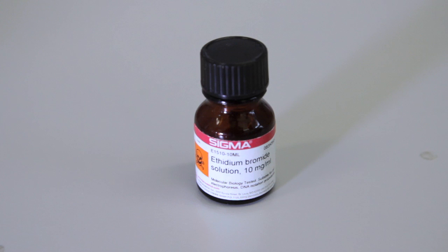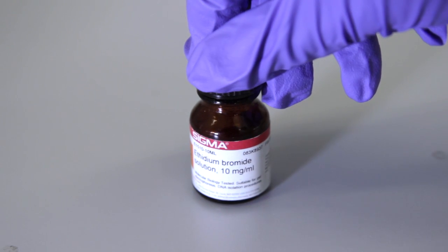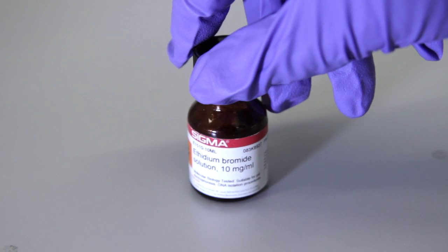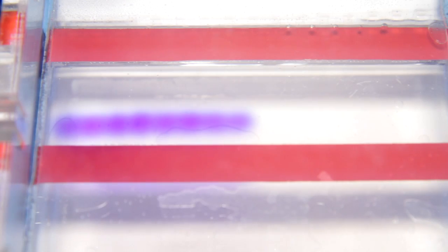If you would prefer, you can stain your gels after they have run. Ethidium bromide is positively charged and runs in the opposite direction to the DNA. If your DNA runs past the ethidium bromide front, post-staining will bring out the DNA bands again.